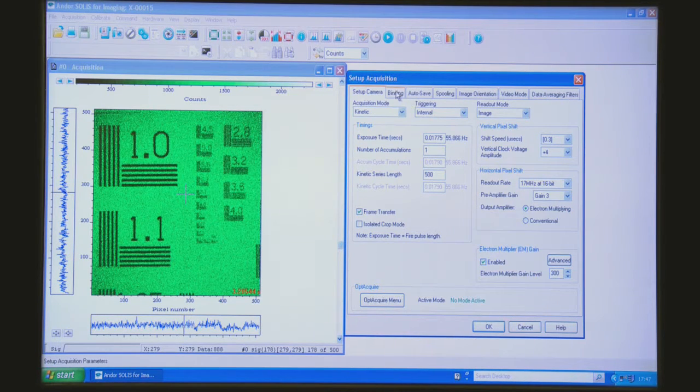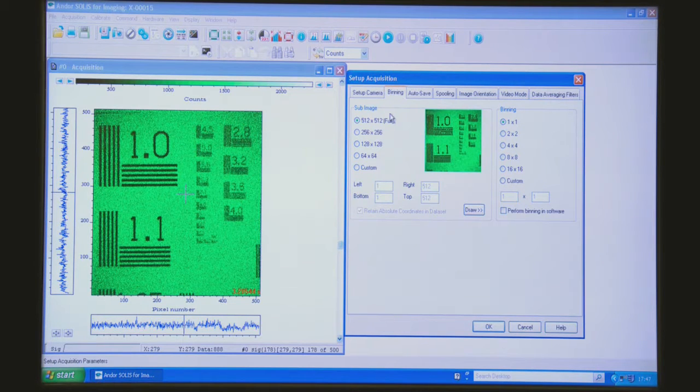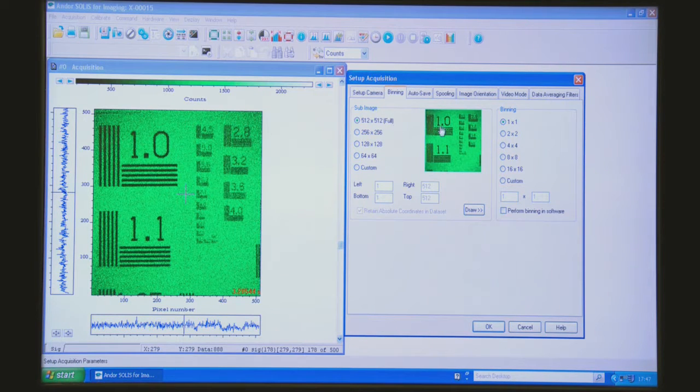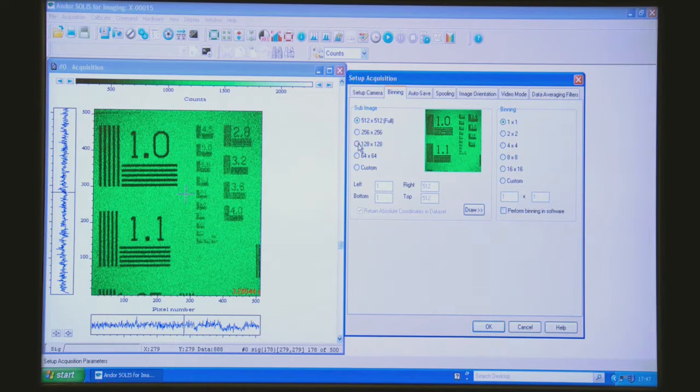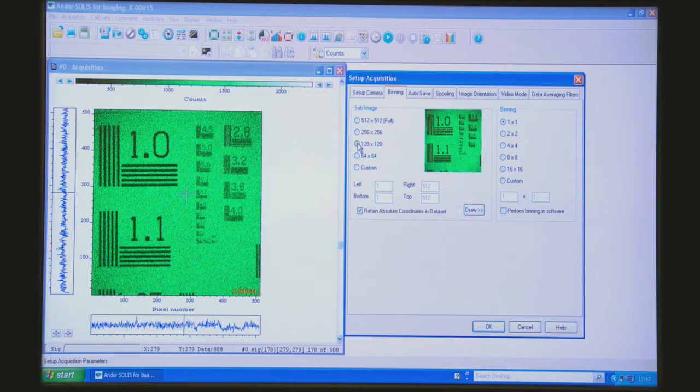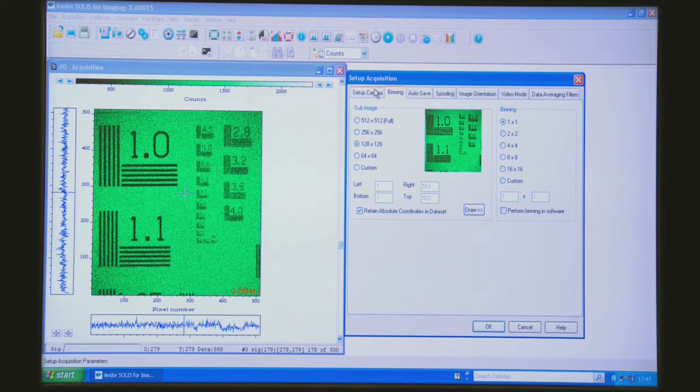Now we're going to click on the tab which lets you access the region of interest and binning combinations. Let's click on the 128 by 128 region of interest. That's just going to locate that very centrally for now.